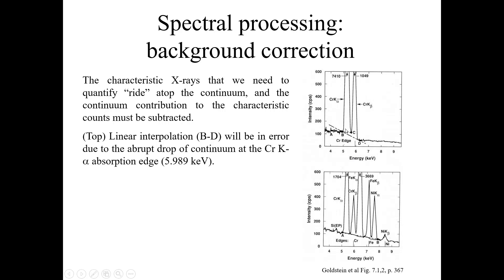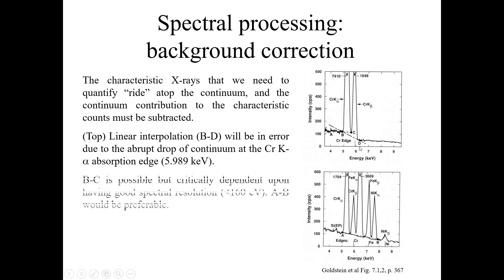Here you can see the linear interpolation from B to D. There will be an error due to the abrupt drop of the continuum at the chromium K-alpha absorption edge, with energy equal to 5.989 keV. The interpolation from B to C is possible but critically dependent upon having good spectral resolution smaller than 160 eV. The A-B approach would be preferable under these conditions.